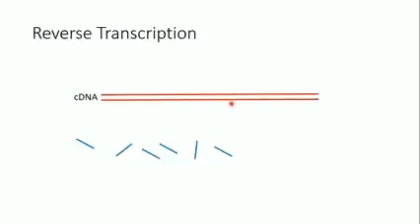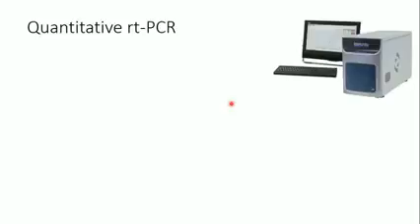Now you know that in real-time PCR, the spectrofluorimeter measures the amount of DNA in the sample continuously during the PCR process. But how can I get the data? So the quantitative real-time PCR, of course, real-time PCR is quantitative. So this is the machine, let's say, of real-time PCR. Normally it's engaged with a computer program, which gives me the data in this form.